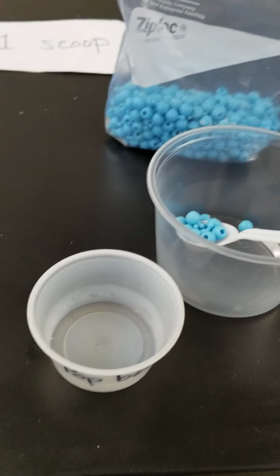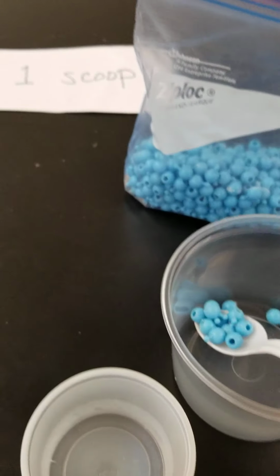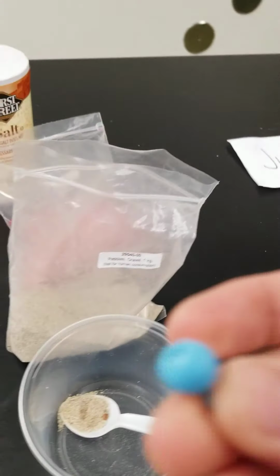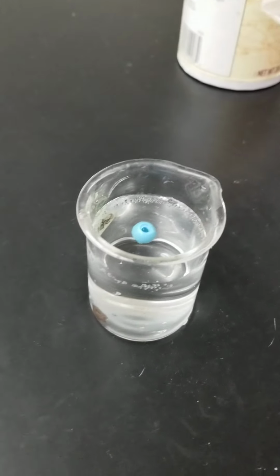All right, next one. Let's do a test for these, which are called pop beads. So touching that, nothing. Pick up one of them. It has a hole in it. It's made of plastic. So let me dump it there. Here's our pop beads.